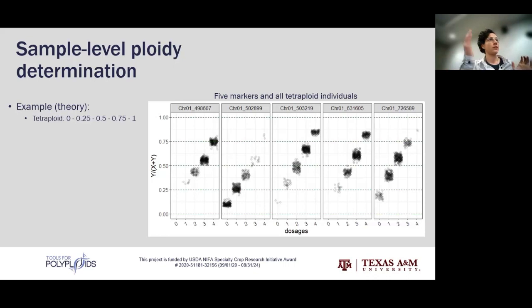And fitPoly can detect this because it works by marker. So it just fits the number of clusters, and you see, okay, I know what's happening.